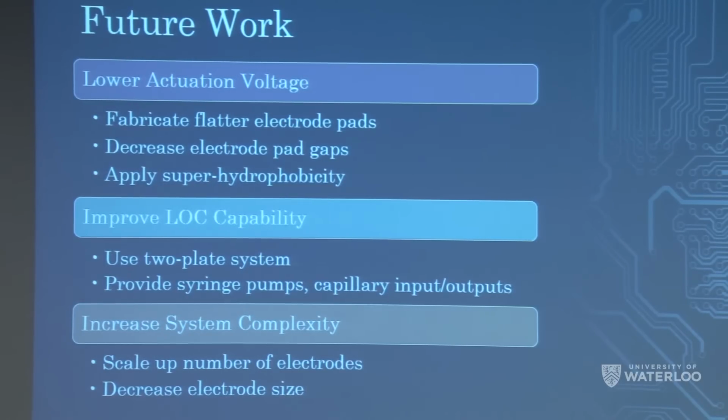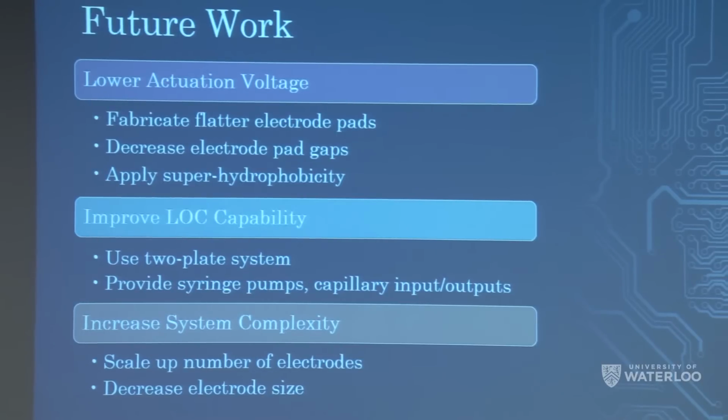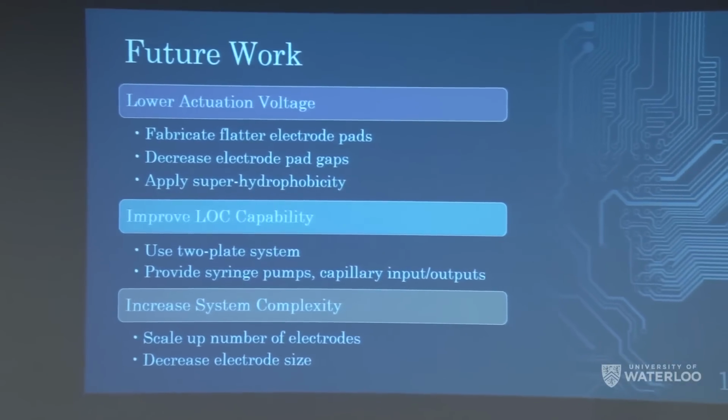There's also a not insignificant gap in between the electrodes, which means that it requires more potential to pull it from electrode to electrode. And then again, hydrophobicity helps move the droplet from place to place.